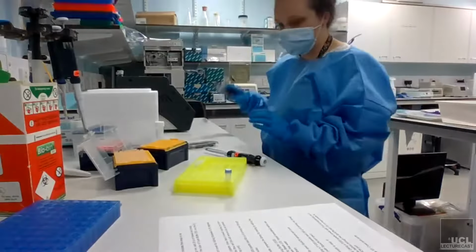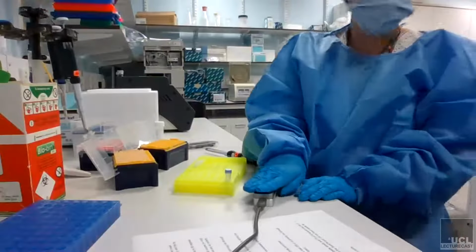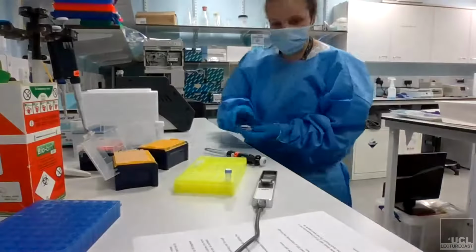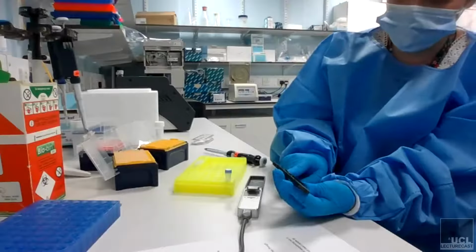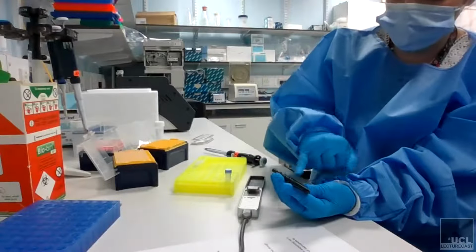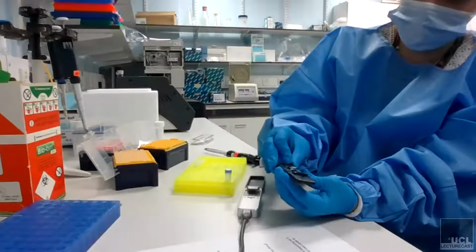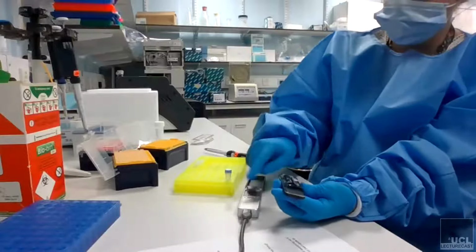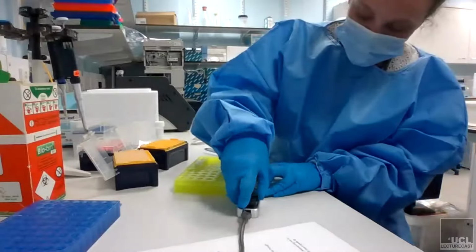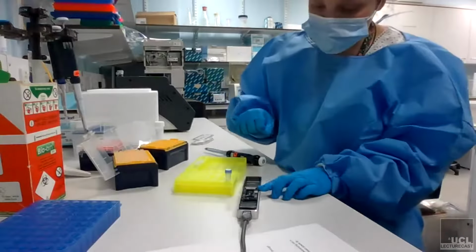Great. Now we can start preparing our flow cell. This obviously will be attached to your computer, but for video purposes, we're going to do it over here. The flow cell is, as I say, this liquid-based channel with the pores here, and then it's got this chip underneath. This is the clever bit. The MinION itself heats it up and transfers the data, but it's actually the flow cell that's the important bit.